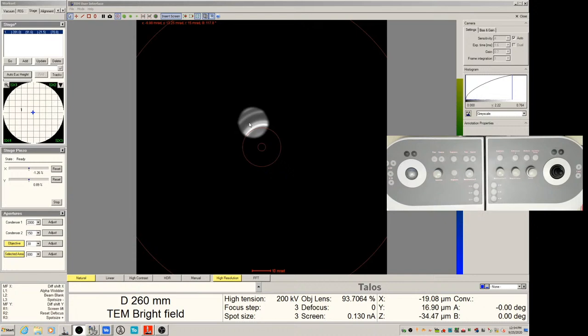So usually I will refer to this kind of dark field as the dirty dark field. The reason I call it dirty is because right now you are not forming the image using the beam that is parallel to the optical axis. You are using the off-axis beams to form the image. That will sometimes deteriorate your image resolution and image quality. So remember, the on-axis portion of the beam can give you the best image.